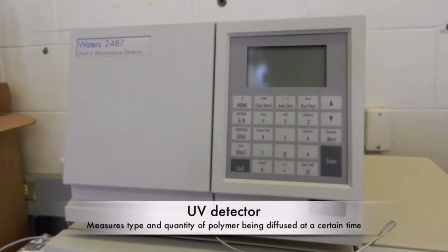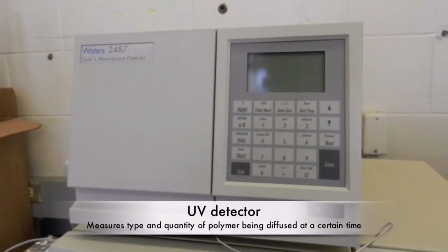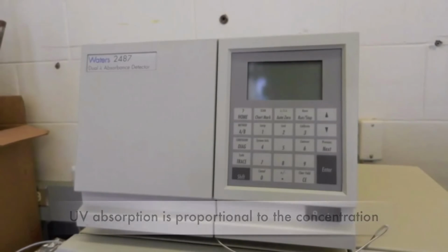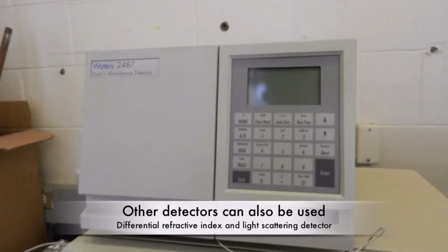Finally, the UV detector is used to measure what and how many particles are diffused at a certain time, creating the distribution graph in the software. The UV detector observes the UV absorption of the polymer, which is proportional to the polymer concentration. Other detectors, such as differential refractive index and light scattering detectors, can be used.